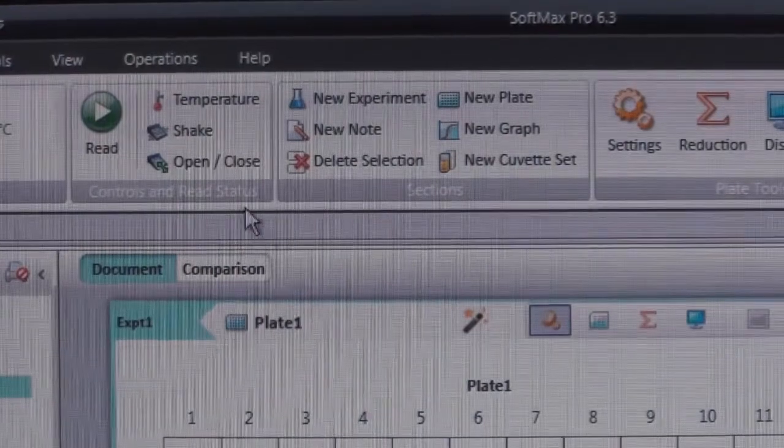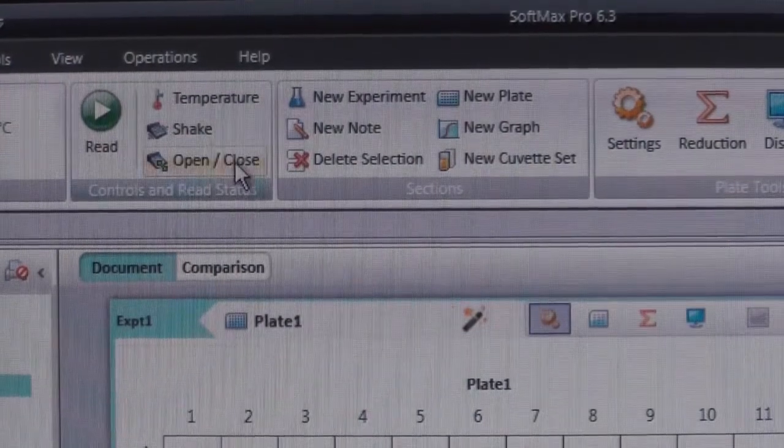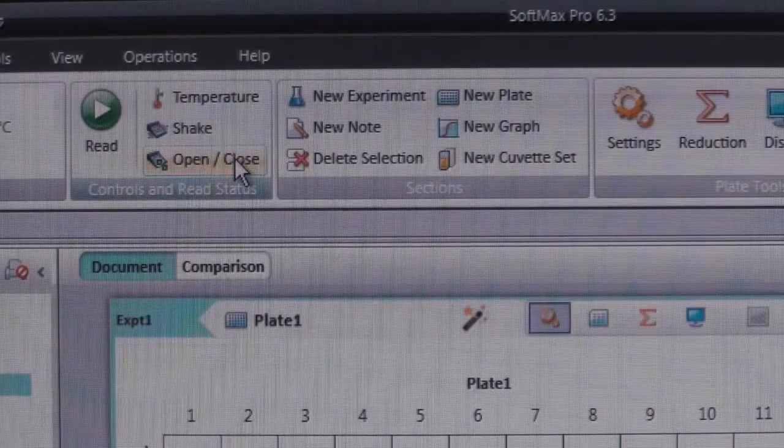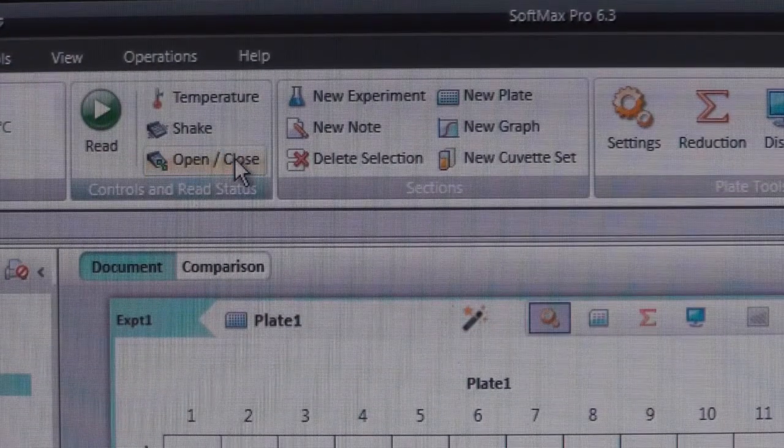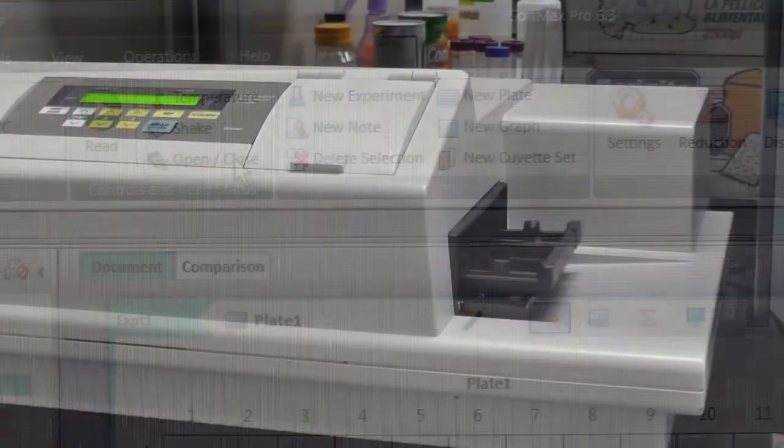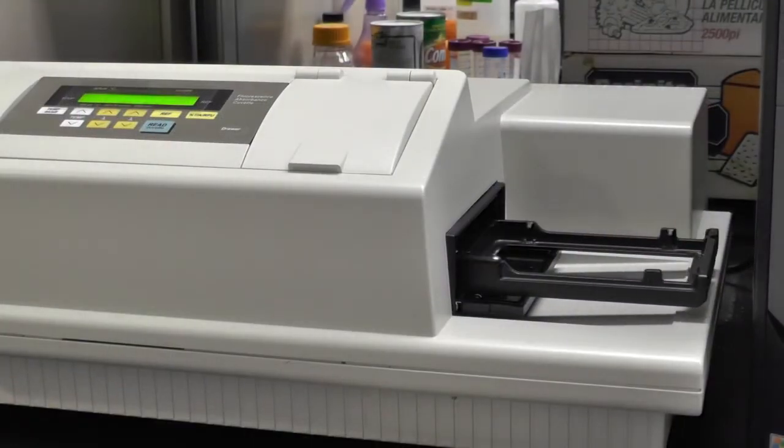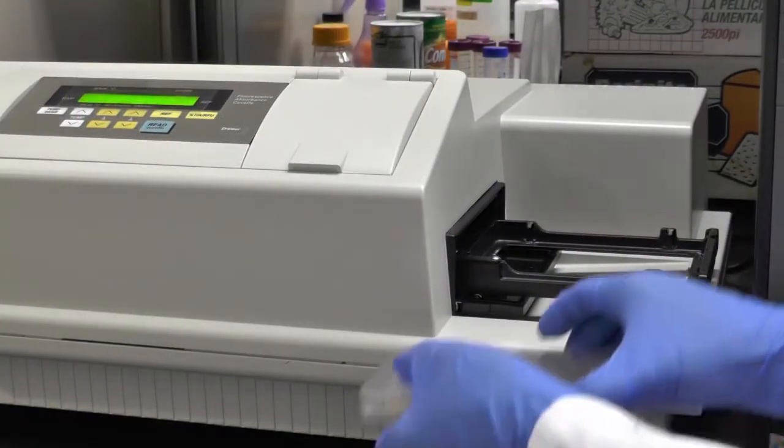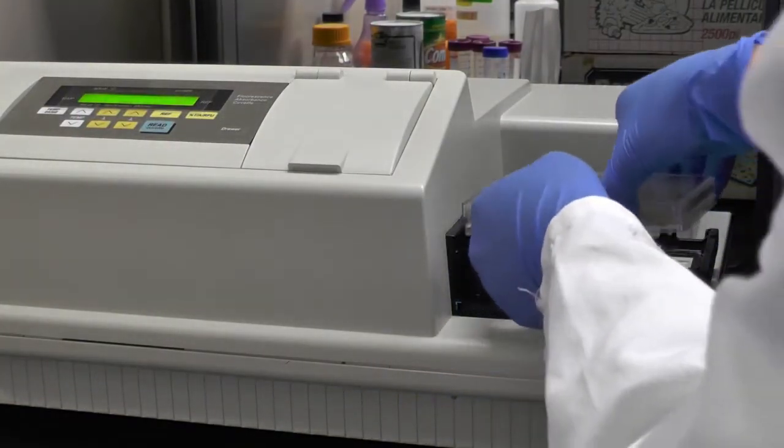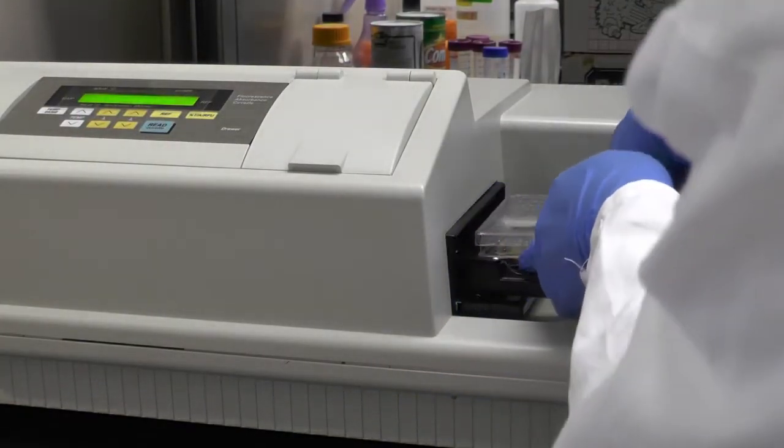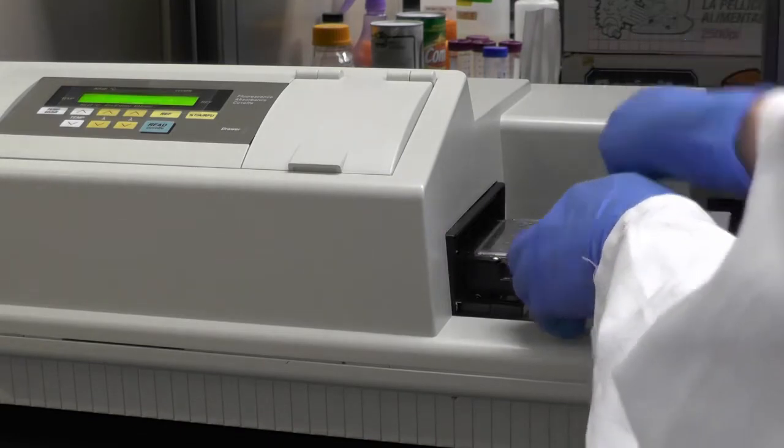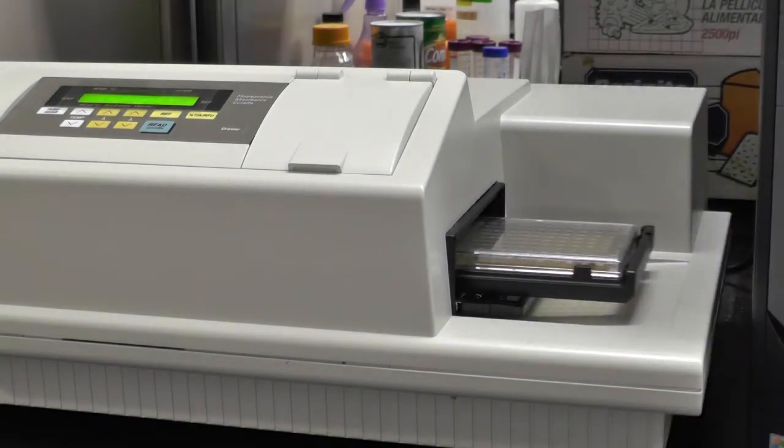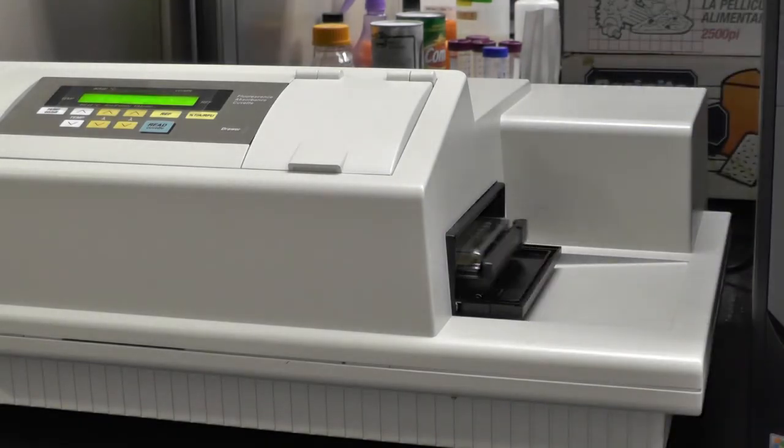To input plates, first click on the Open slash Close icon in the top panel. The instrument door will automatically open. Then carefully load your plate into the machine and press the same icon once again to close the door.